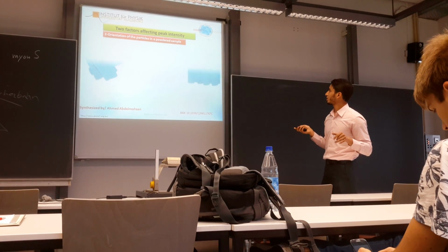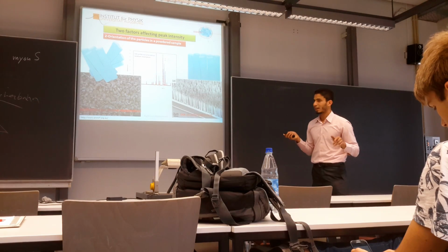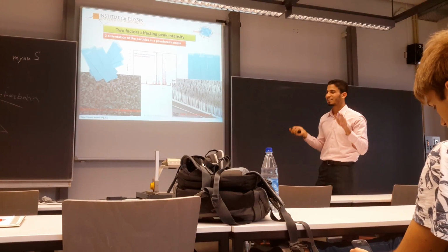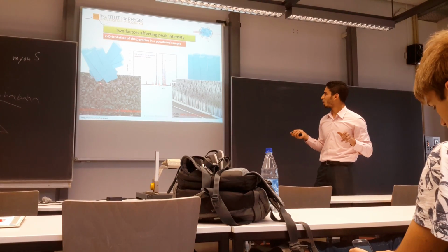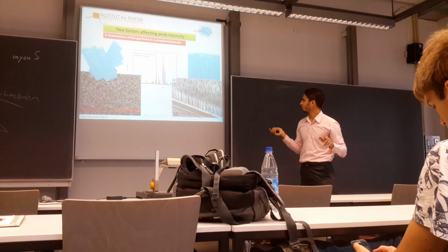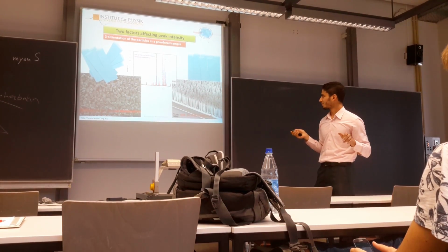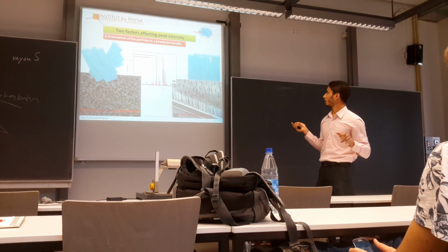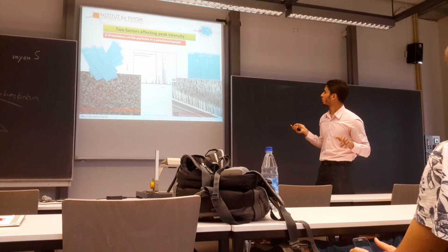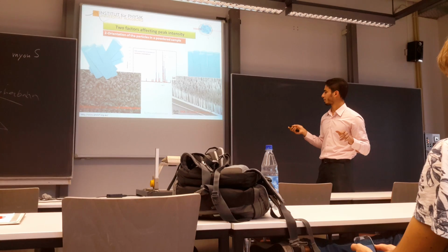Second factor is the orientation of the particle in the powder sample. I think I have some experience in preparation of the materials. I prepared this material in Egypt before coming here, but it's very difficult to control the orientation. In this case, it's very difficult and very expensive to control orientation and dimensions of this material. But in the first case here, we have controlled orientations in one side. This is different, so we have here different intensity according to the direction.